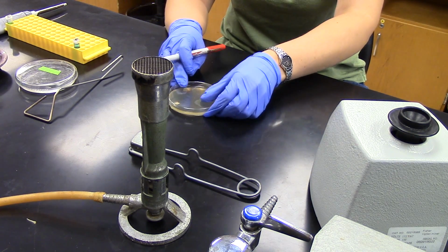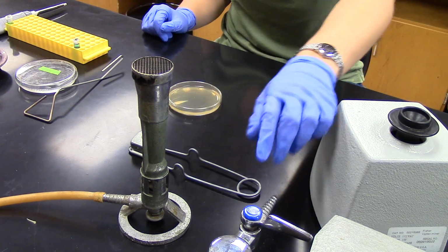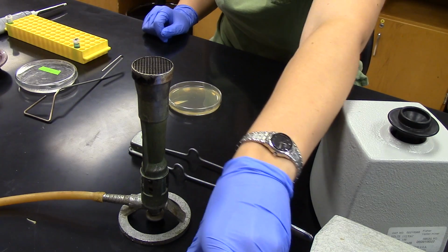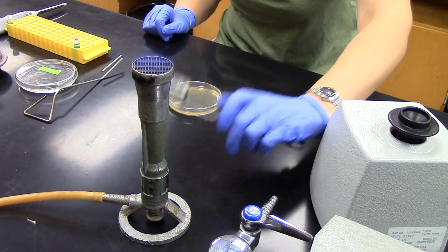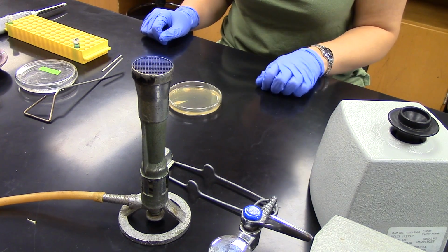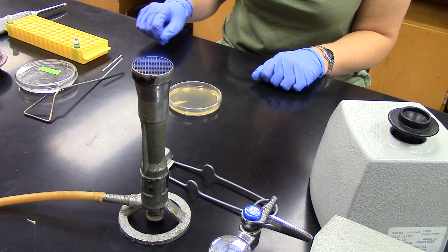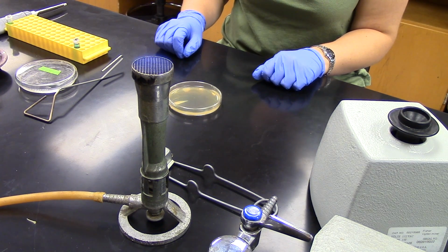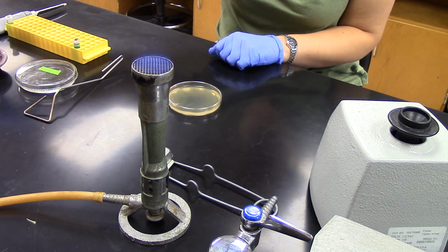Once you've got your plate labeled and you're ready to actually do the plating, you'll want to start by turning on your Bunsen burner. So you turn the gas all the way open and flame. If it doesn't light immediately and you try a few times, you might want to turn the gas off, kind of wave your hands around to dissipate the gas again. When you're done with the Bunsen burner, you just turn the gas all the way to the off position. All right, so now you're ready to plate.